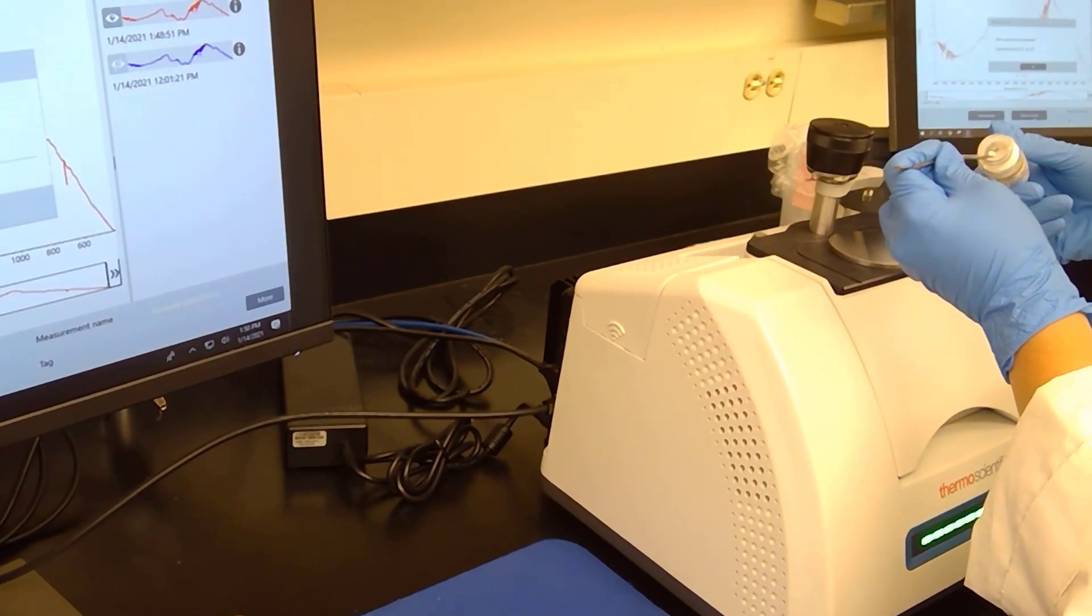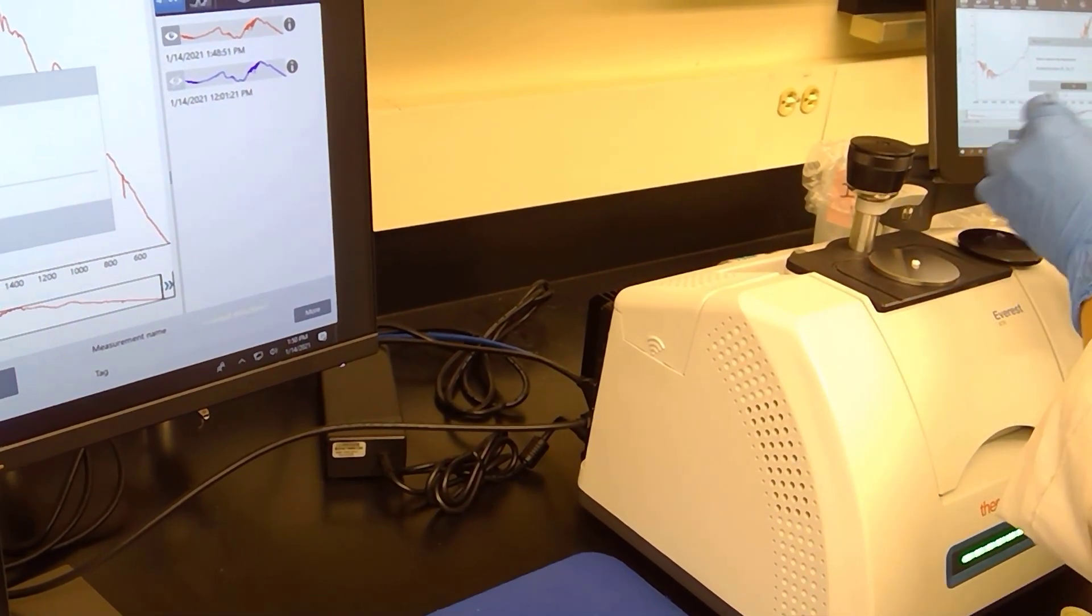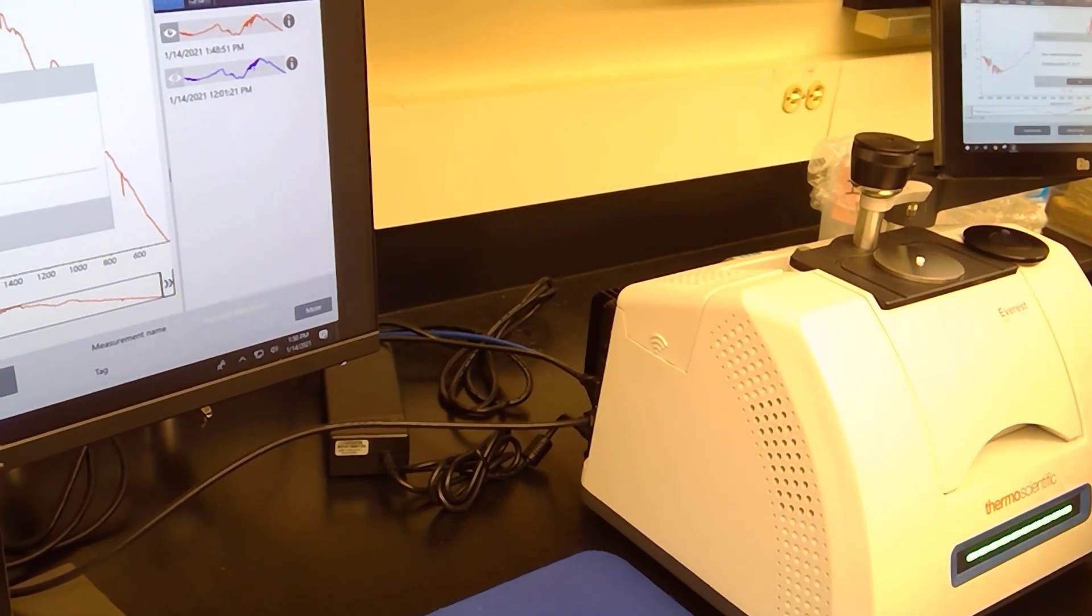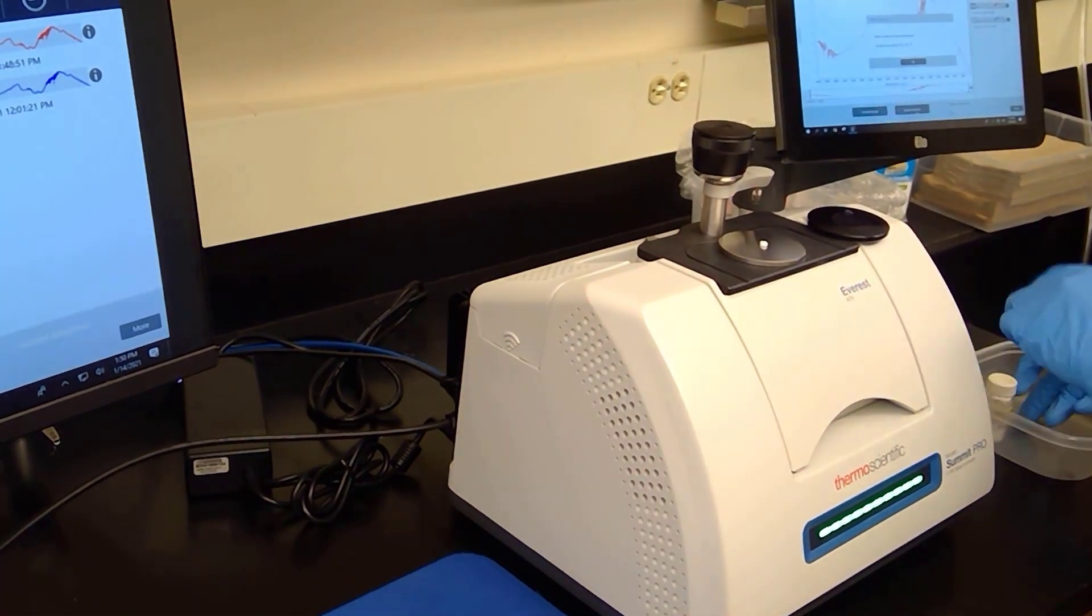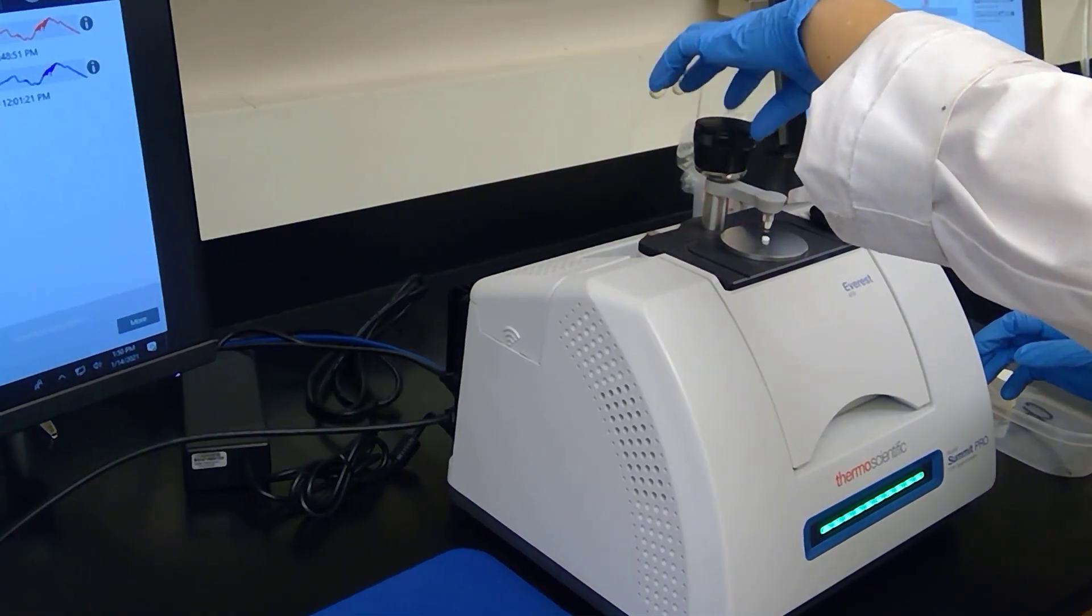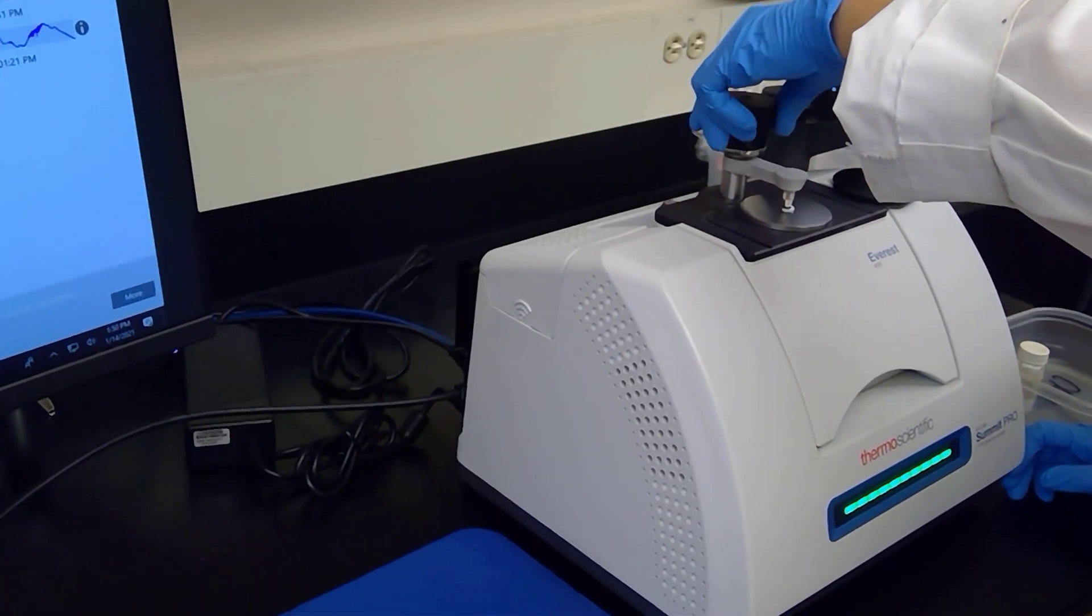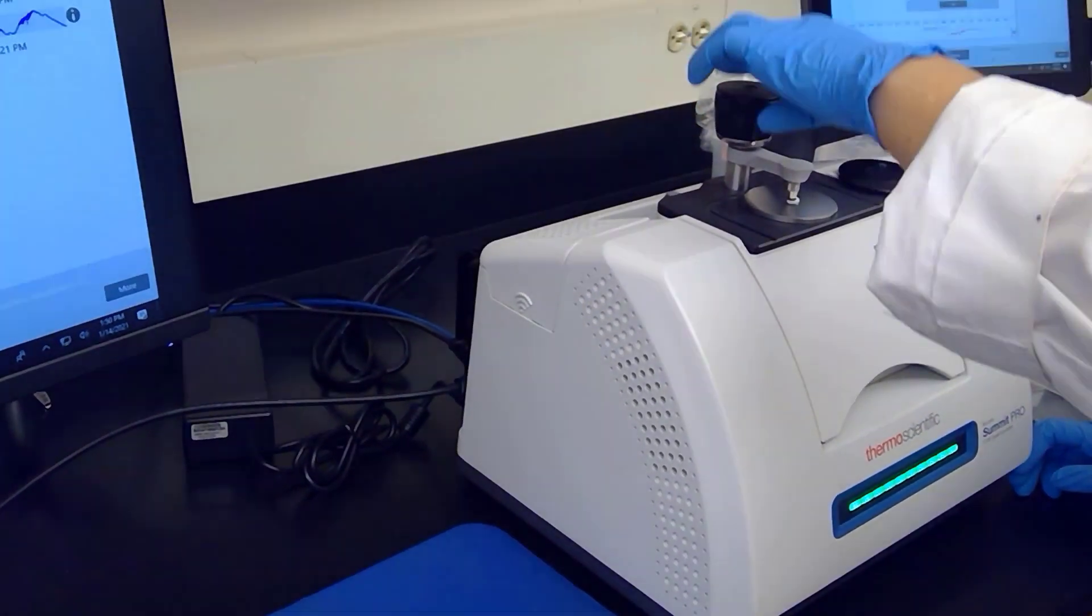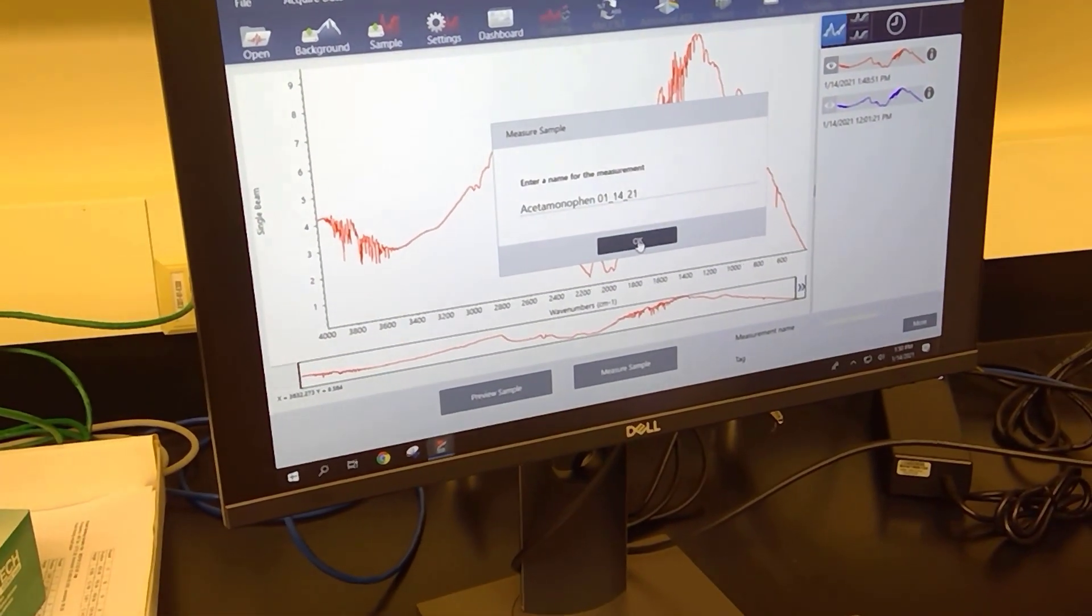I'm going to take a small scoop of acetaminophen from my scintillation bottle, and it doesn't have to be very much. I'm going to place it right on the crystal, and now I will press my solid using the pressing arm. Now we can go ahead and click okay and request that the sample be read.